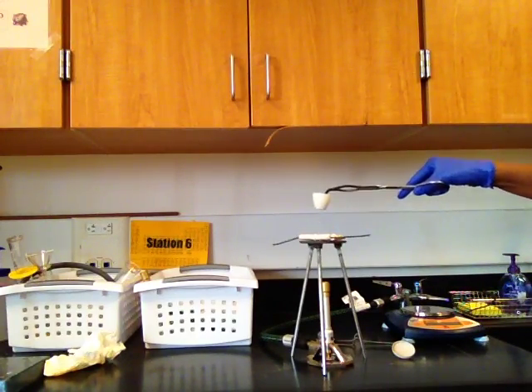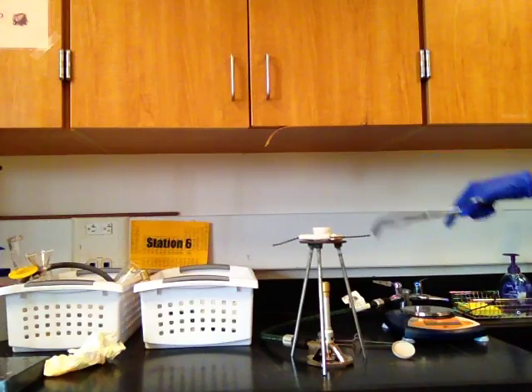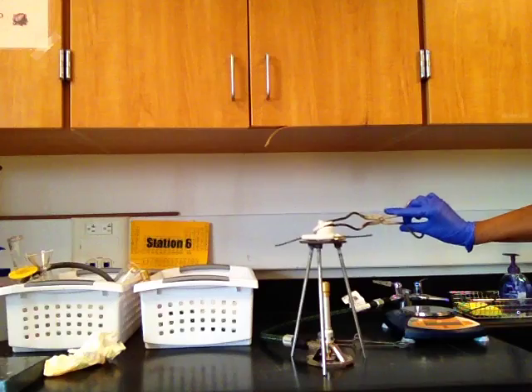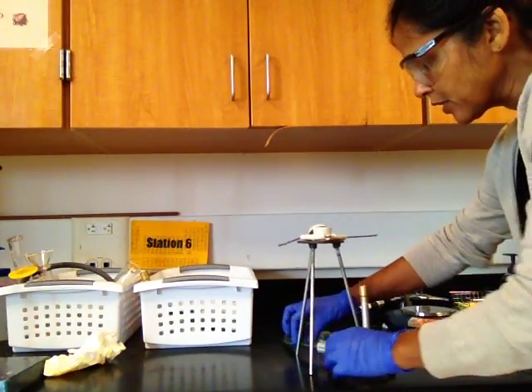You will have a crucible. These are crucible tongs. Make sure you hold the crucible with the narrow side of the tong, and you will need a crucible lid, and you put it on. And the first step here is to purify your crucible. For purifying your crucible, you need to turn on the burner.